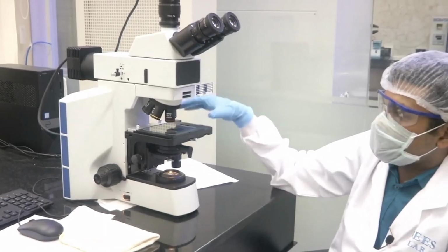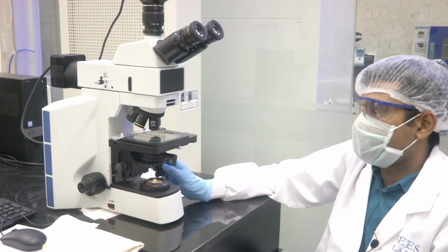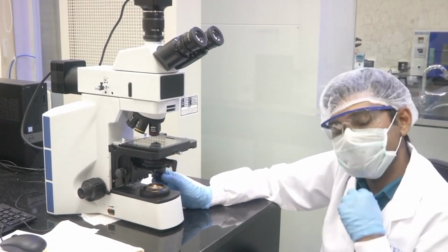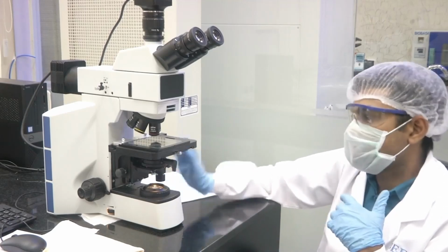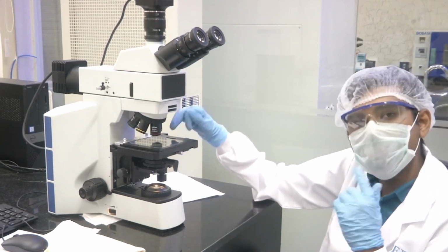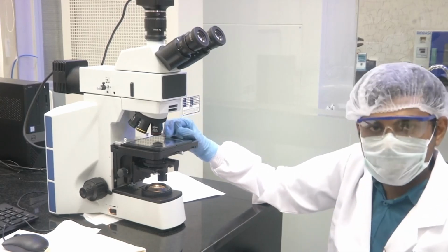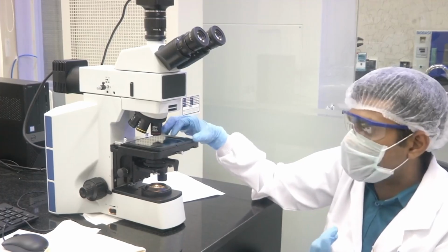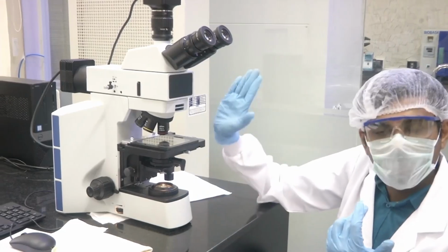Same as what we saw before, we have another sample holder here, but this sample holder is slightly more complex. It is engineered and machined for fine adjustments. There is a transparent platform. If your sample is transparent, like a glass slide or a petri dish or a tissue culture dish, you can keep it on top of this and the bottom illumination can pass through your sample.